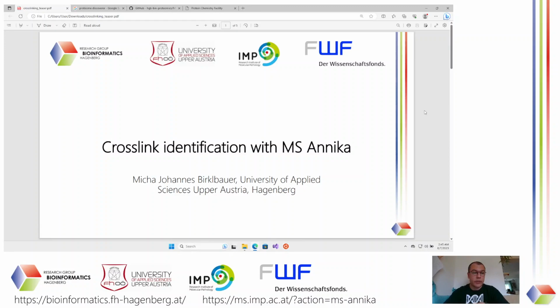The middle part of this video is going to be about the general workflow of MS Annika doing cross-link identification from MS2 data. And in the end, we will probably go over some more advanced topics like defining your own crosslinkers in Proteome Discoverer, or how we deal with, for example, MS2, MS3 acquisition. So yes, let's get started.